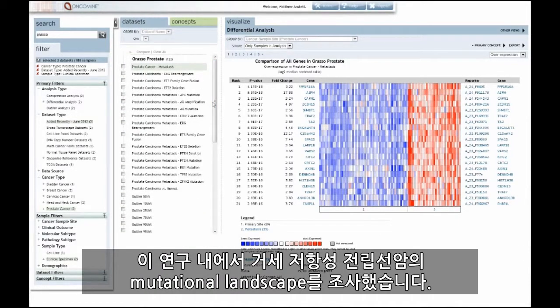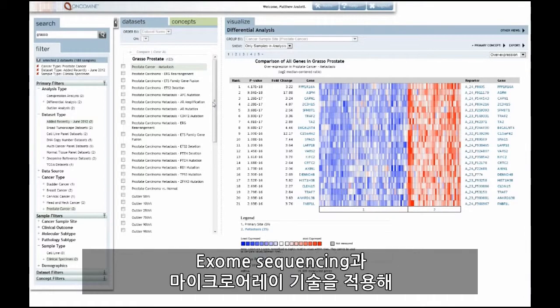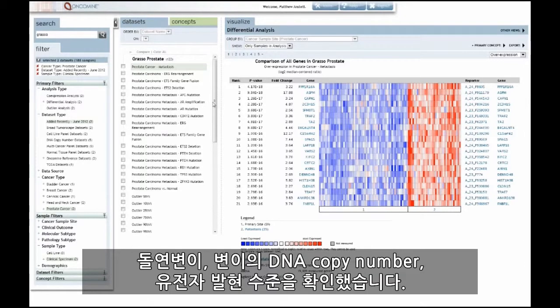Within this study, the mutational landscape of castration-resistant prostate cancer was investigated. Both exome sequencing and microarray technologies were applied to determine mutations, DNA copy number changes, and gene expression levels.